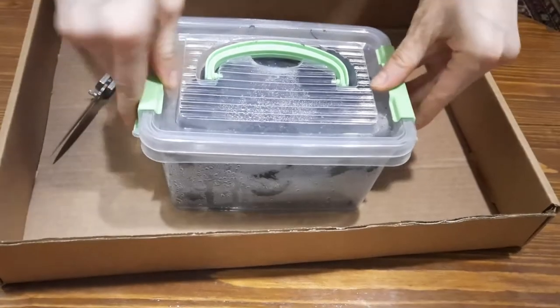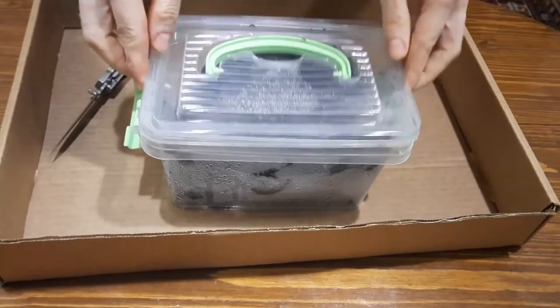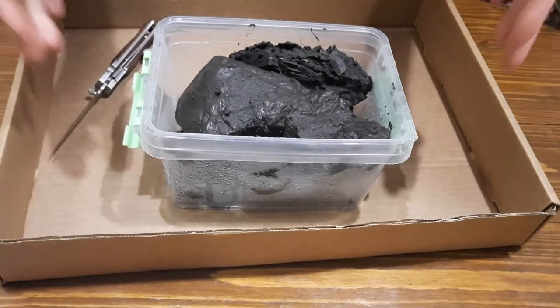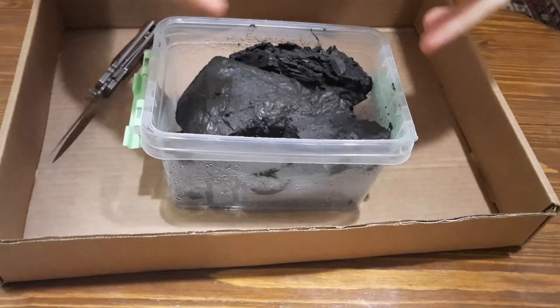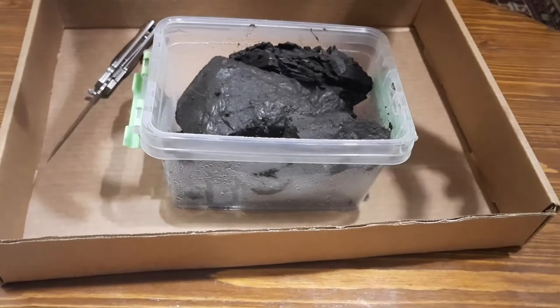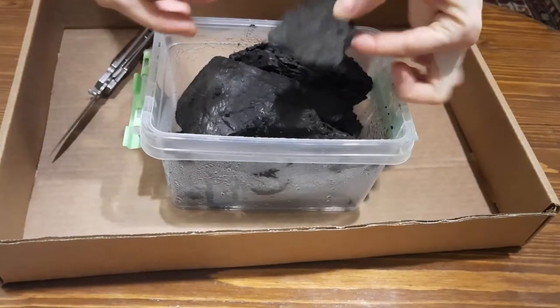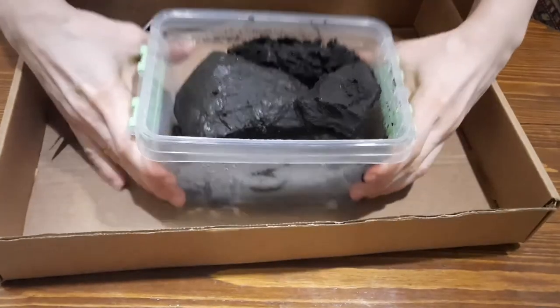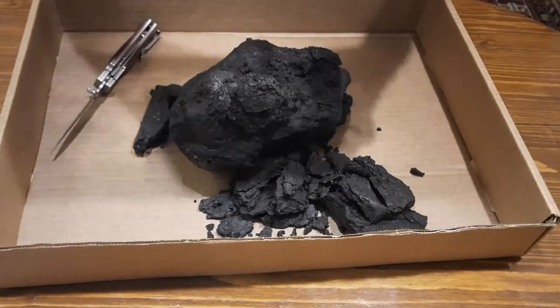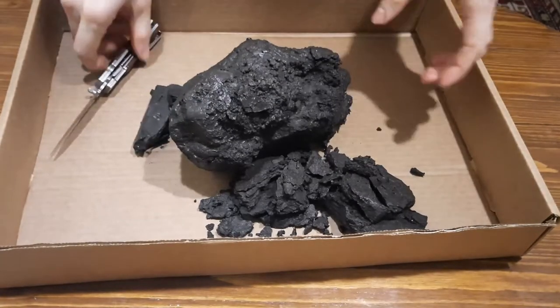Вот глина, которую мы привезли из Маркова — мы её открываем. Нам нужно, чтобы она подсохла и из неё ушла лишняя жидкость, которая в породе сейчас сохранилась. Я думаю, что её порезать или поломать будет легче не тогда, когда она будет уже сухой, потому что глина очень плотная, а именно сейчас, пока она ещё во влажном состоянии.